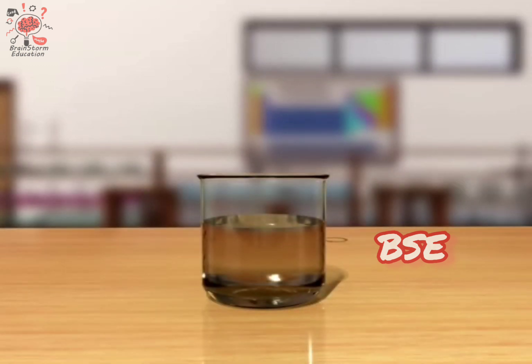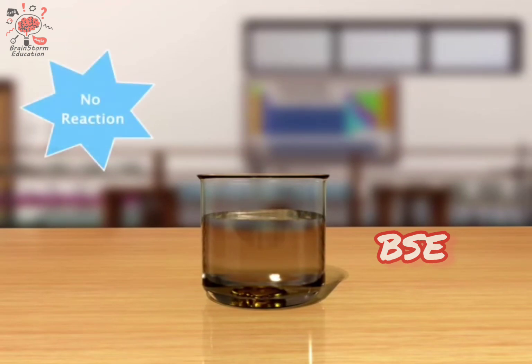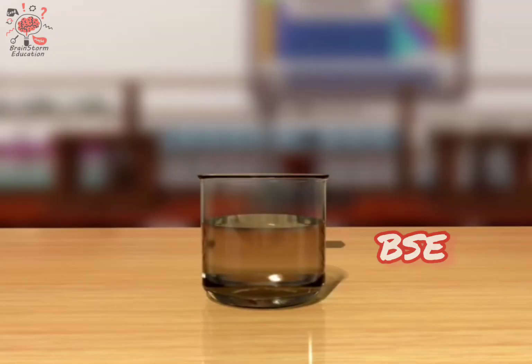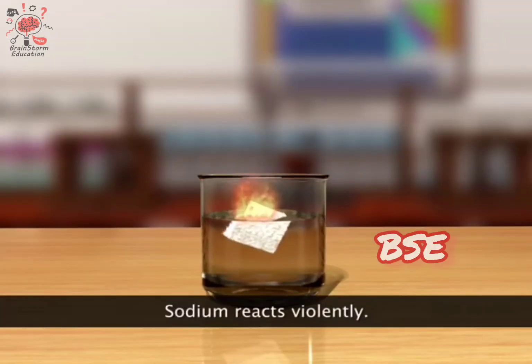Let's consider gold first. Drop the gold ring into the water. Nothing occurs. Let's drop a piece of sodium metal.